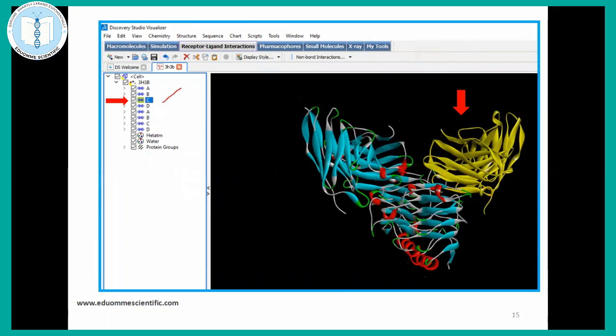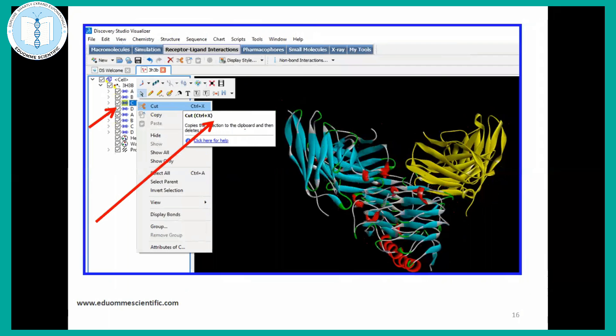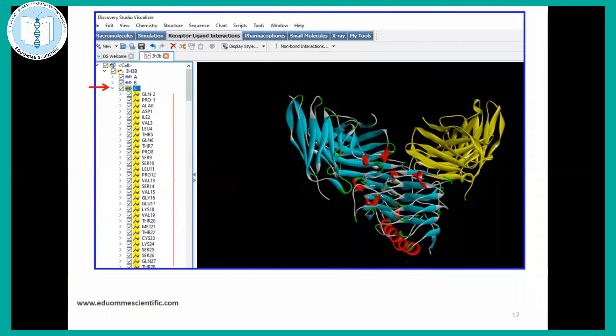Now, if you want to select a particular chain, you can get it from here, like I have done for you guys. I have selected C chain of this protein. Now you can see it's in a yellow color now. If you want to delete these things or do further analysis on that, you can do this right click or control X and you can get the deletion of those things.